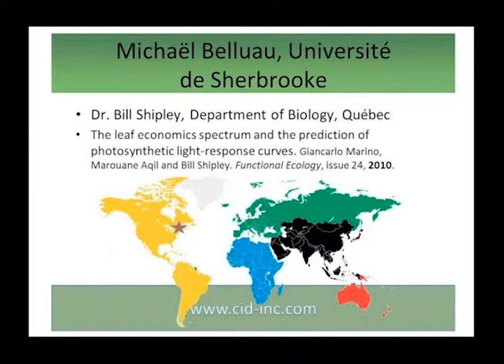And Dr. Shipley last published in 2010 using the handheld photosynthesis system in a paper titled The Leaf Economic Spectrum and Prediction of Photosynthetic Light Response Curves. And he used the CI340 and the light accessory module to investigate those light response curves.